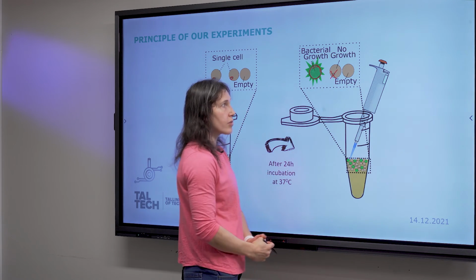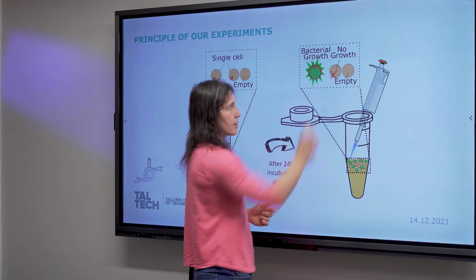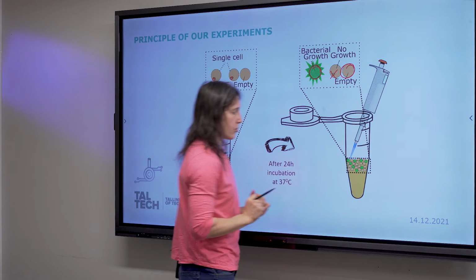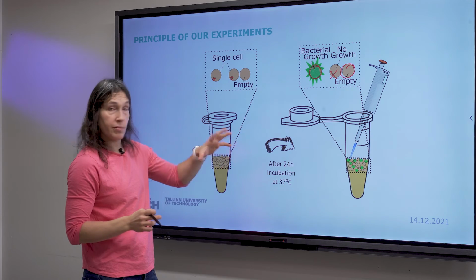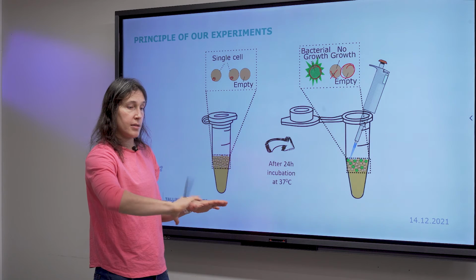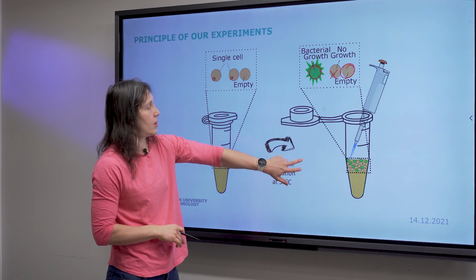So there is no growth and no fluorescence. And some droplets will also be empty, and from those there's also no growth. So this way we can distinguish: are bacteria alive? We score them 1. Or is the droplet empty or the bacteria dead, meaning no growth, and scored 0.